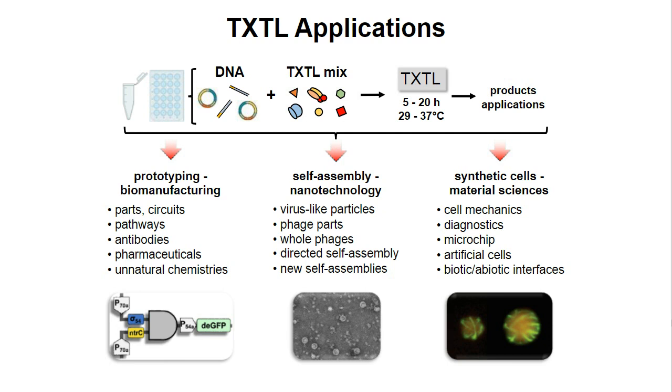And finally, the third main application of TXTL is synthetic cells and material sciences. TXTL is very well suited to build synthetic cell systems, like you can see in the fluorescent image at the bottom right corner. You see two liposomes loaded with a cell-free gene expression reaction to express a cytoskeletal protein, the cytoskeletal protein MreB, that polymerizes at the inner membrane of liposomes.